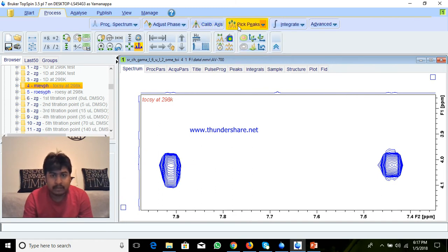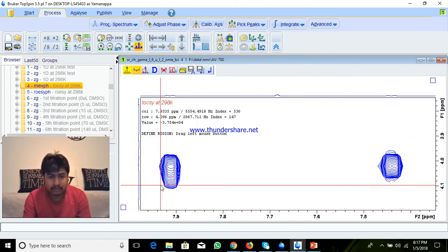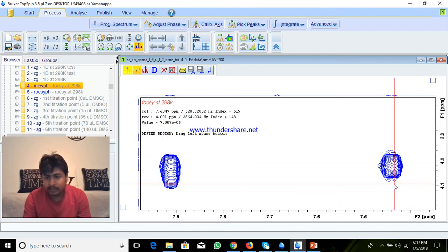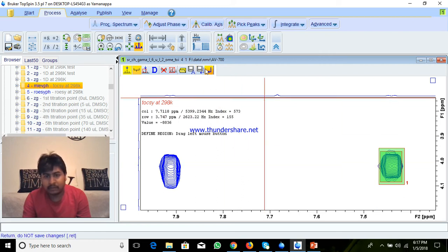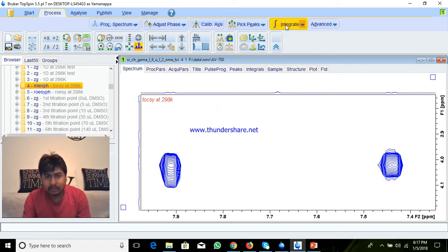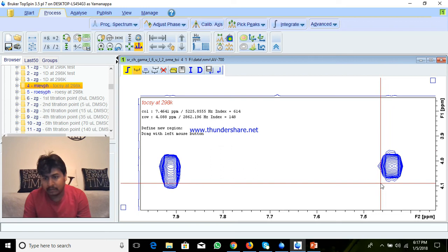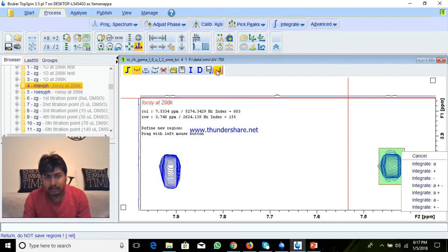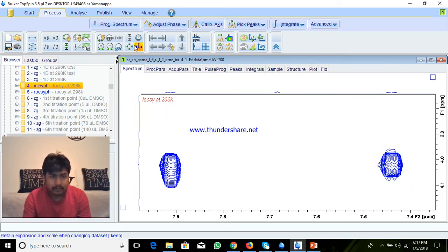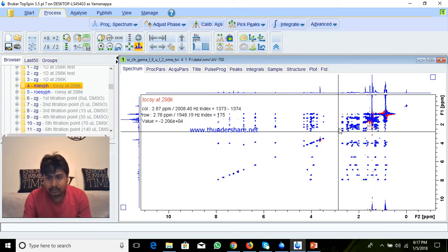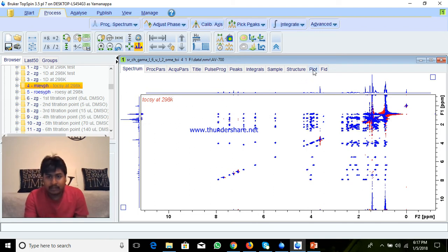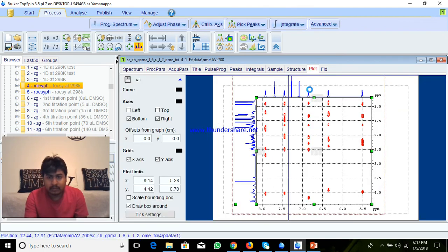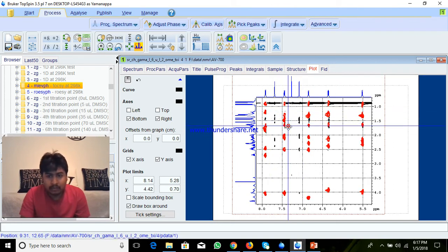After that, I want to extract this as a PDF. I will go to Plots — what I will do is remove all the default things, then open a new one. I want to create a new layout — this is a 2D spectrum — I dragged this in.